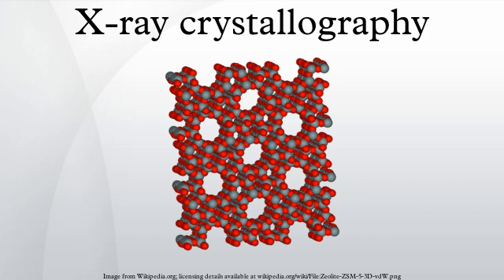Methods. Overview of single crystal X-ray diffraction. The oldest and most precise method of X-ray crystallography is single crystal X-ray diffraction, in which a beam of X-rays strikes a single crystal, producing scattered beams. When they land on a piece of film or other detector, these beams make a diffraction pattern of spots. The strengths and angles of these beams are recorded as the crystal is gradually rotated. Each spot is called a reflection, since it corresponds to the reflection of the X-rays from one set of evenly spaced planes within the crystal.